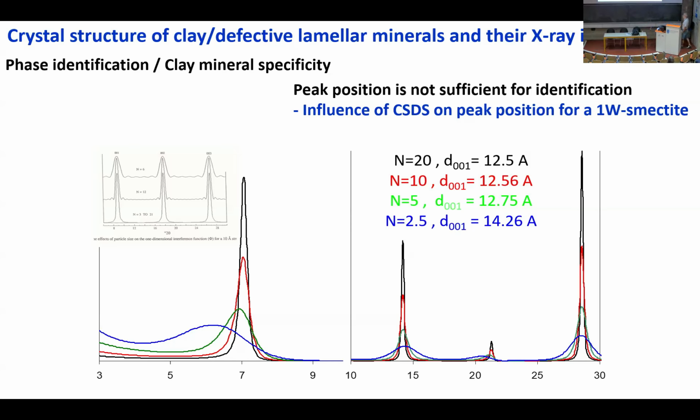And if we want to assess some specific and small variation, or to assess them as precisely as possible, we have to prepare the sample in the right way and to measure it in the right condition.